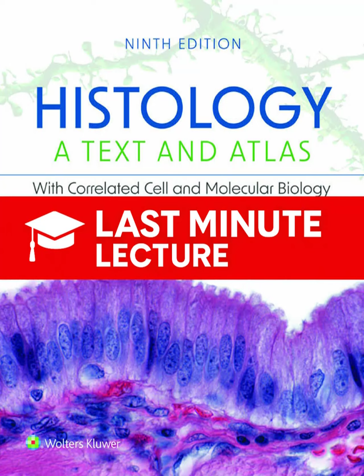In a way, yes. After you develop it, the exposed silver halide crystals turn into metallic silver, which show up as these little dark grains right on top of where the radioactive material was located. Figure 1.8a shows a really clear example of this with light microscopy. That's a lymph node section where they were tracking cell division using radioactive thymidine. You can clearly see clusters of these little black silver grains specifically over the nuclei of the cells that were actively making DNA to get ready to divide. So you can literally see which cells are proliferating. It's a direct measure of cell proliferation.